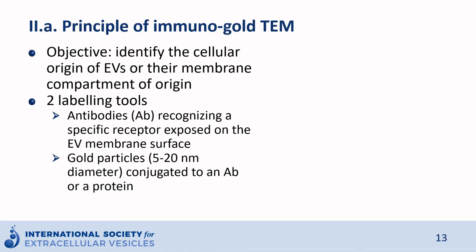Let's turn to immuno-gold TEM. The objective of immuno-gold TEM is to identify the cellular origin of EVs or their membrane compartment of origin, in general, in a sample containing different EV populations. The principle of immuno-gold TEM is similar to immunofluorescence microscopy.